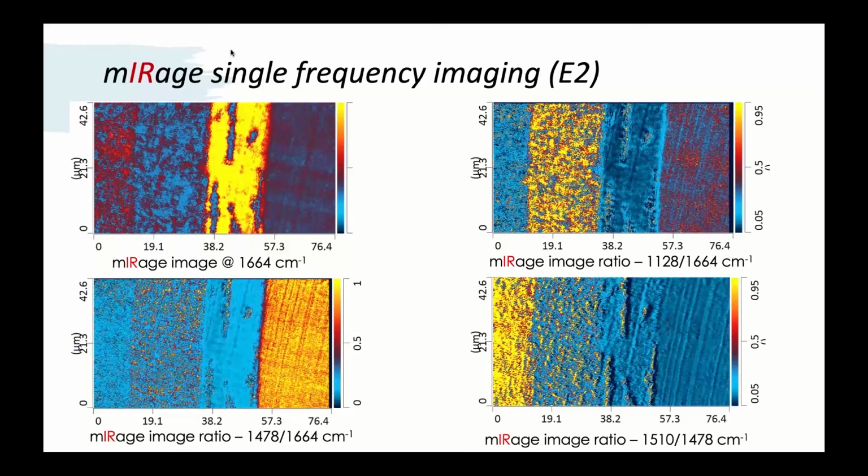And you could see it in these hyperspectral images or single frequency images, how the boundaries are really sharp and focused. So even though it is a concern or had been a concern when doing cross sections in the past, there doesn't seem to be any evidence of it happening, even just using a really sharp blade and cutting it. So I think that we've shown that that's not really a concern to have anymore.